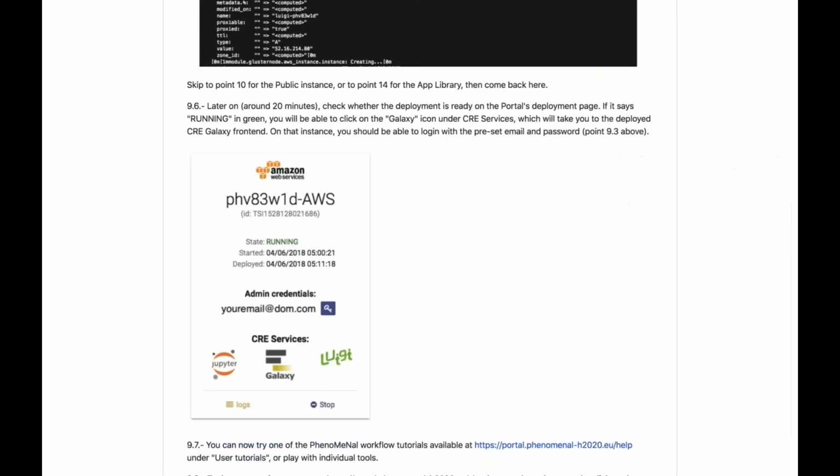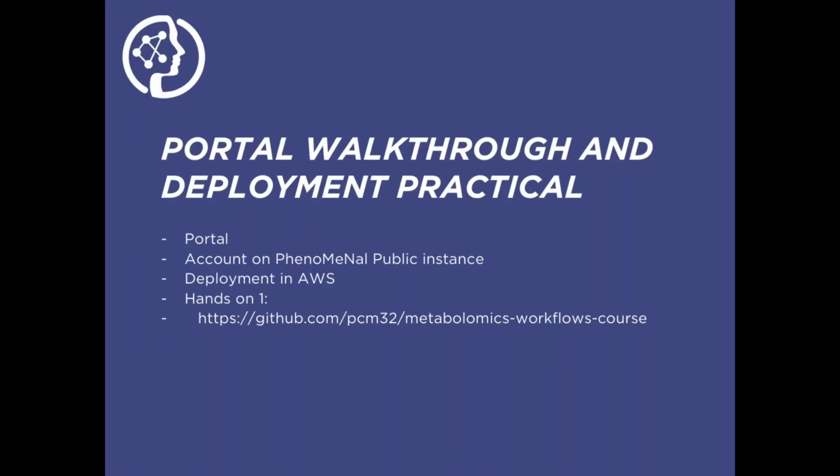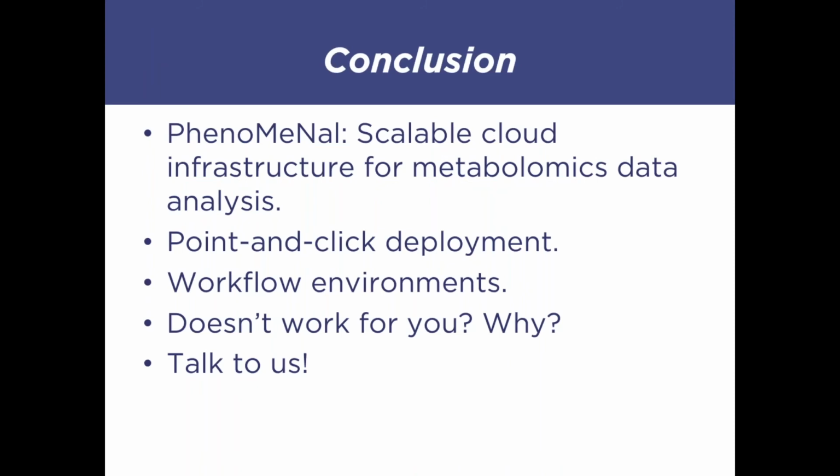Let me get very briefly to the slides. As a conclusion then, PhenoMeNal is a scalable cloud infrastructure for metabolomics data analysis. It's a point-and-click deployment setup that allows you to very easily have a small cluster of computers to do data analysis. It provides you with workflow environments where you can use different tools to do the metabolomics data analysis that you're after. If for whatever reason it's not working for you, we would really like to know how we are not being able to adapt to your needs. So please talk to us. We would really like to know that feedback. And with that, I will thank you for listening to this presentation.